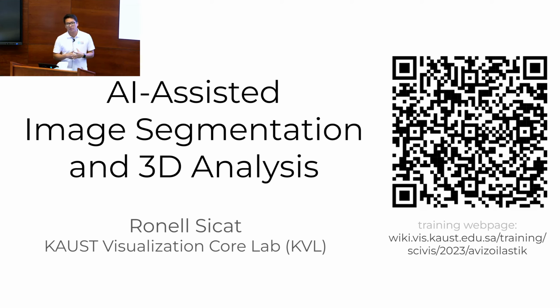But this time we're going to focus on AI assisted tools, which is kind of the trend, as you all know. But I'll still go through some of the basic stuff because we need that basic knowledge to use Avizo and Ilastik, for example, before we can use the AI assisted tools.